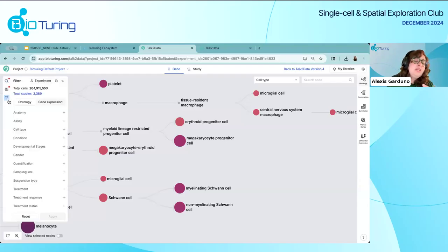If you want to focus and make it very specific to a disease area, you'll need to add very specific filters into the ontology tree. That really focuses on specific standardized ontologies that are mapped across these different studies. It's a way that we normalize all of the studies in the system so you're able to run this cross-study analysis.